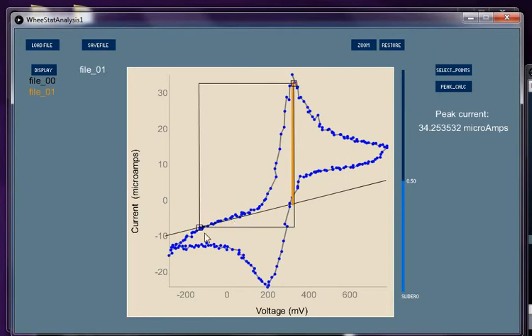Now we hit select points and then we hit peak calculate. That gives us this black line that is our baseline and this orange line which is our current amplitude. You can see that the baseline isn't exactly where we want to have it. So we have this slider over here that allows us to change the slope. You'll notice that the baseline position stays on the point that we have selected. Let's say that's where we want our baseline to be.